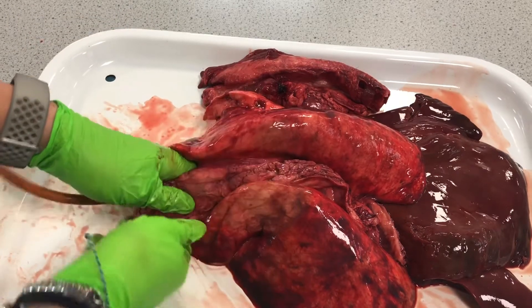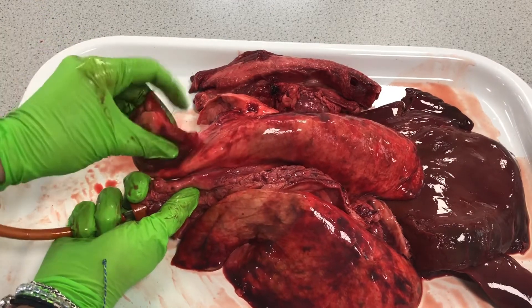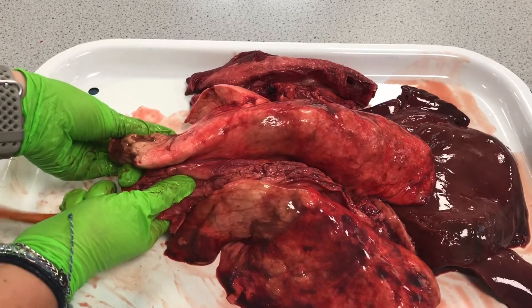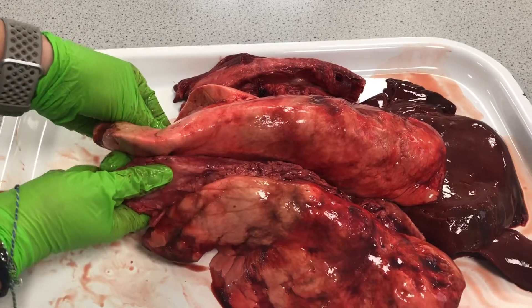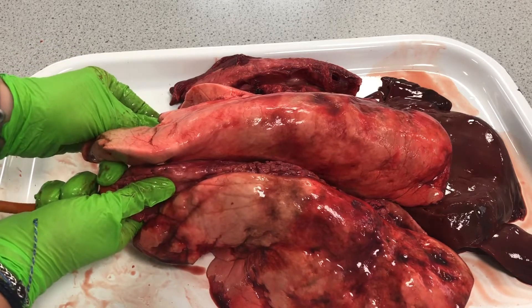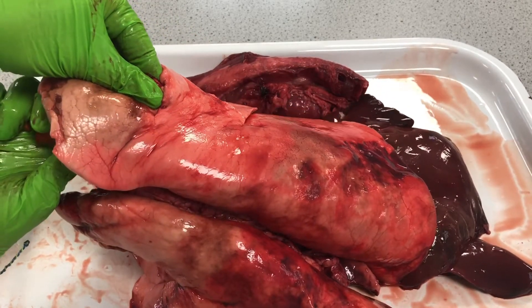We've got a bit of a slash over here in the bronchial, and we can feel the air escaping from there. So I'm just going to hold my hand over that — and look at that, much, much better inflation. I've found where we've got a slight gap, and you can see the shape of those lungs as they start inflating.